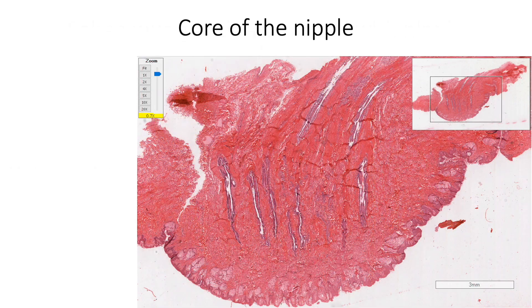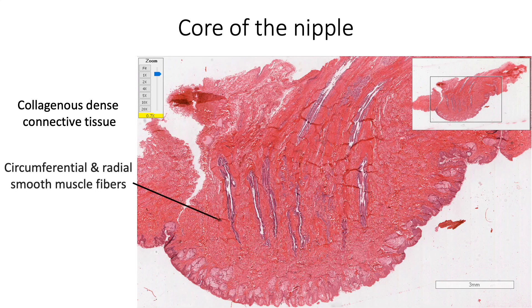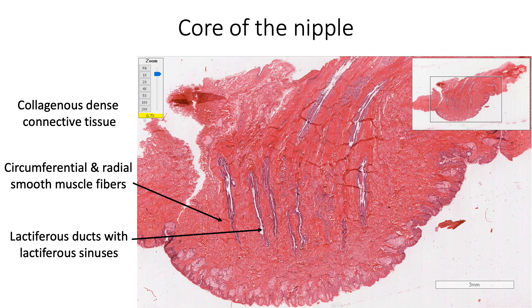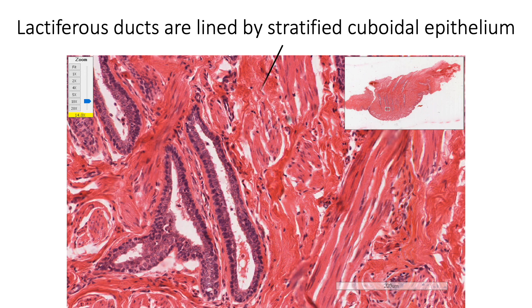The core of the nipple is made up of collagenous dense connective tissue, circumferential and radial smooth muscle fibers, and 15 to 20 lactiferous ducts, which dilate to form lactiferous sinuses just before they open onto the surface. Lactiferous ducts are lined by stratified cuboidal epithelium, which changes to stratified squamous epithelium just before it opens onto the surface. We are also seeing smooth muscle fibers in the core of the nipple here.